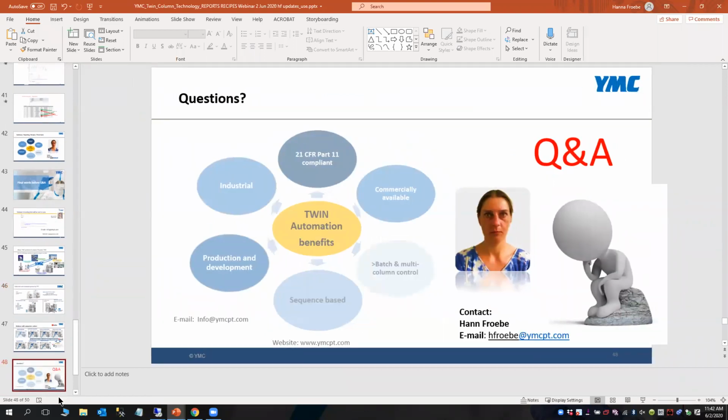Okay, let's bring it back to Hannah for Q&A. And thank you, audience, for your questions. We do have a few of them. Let me start off with Hannah. How many levels of access are there in the software?